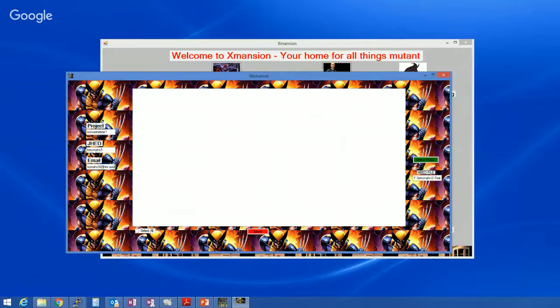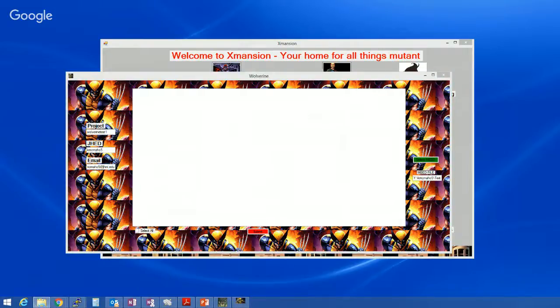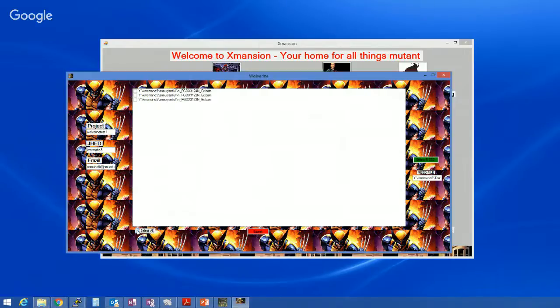So then I'm going to move over some BAM files from my aneurysm project. I've been using these in some of my other videos here. All of these seem good. The order doesn't matter, so I'm just going to select all, and then I'm going to hit submit. And they will be transferred over to the cluster, and each one is going to be split into 4 different smaller files. When it's done, you will receive an email letting you know where it stands.